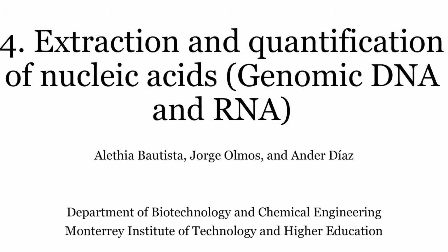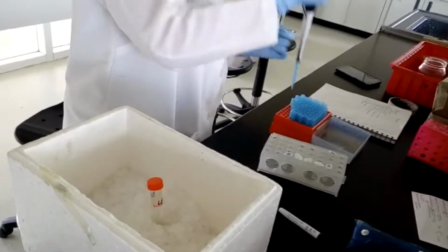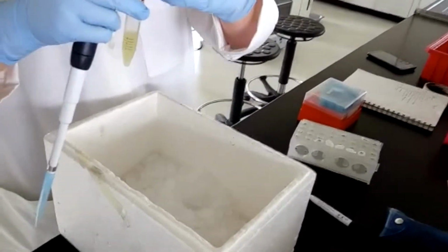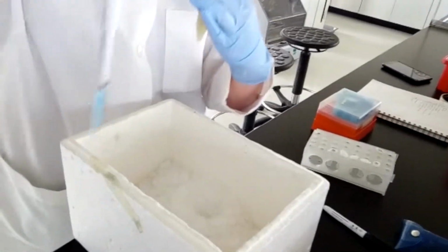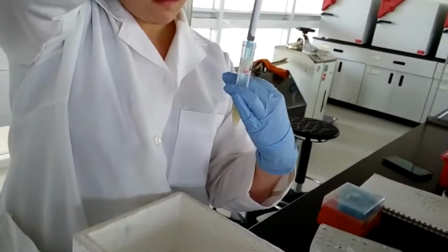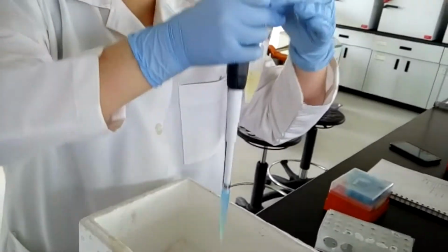DNA extraction is, as its name suggests, a technique used to obtain DNA from organic samples, in this case, blood. There are different methods to accomplish this, but regardless of the method chosen, the process consists of three basic steps. Cell lysis. By a lysis solution, which is rich in salt, we break macromolecules such as proteins and allow DNA denaturalization. This process shall be repeated several times to ensure the degradation or disappearance of any other macromolecule.